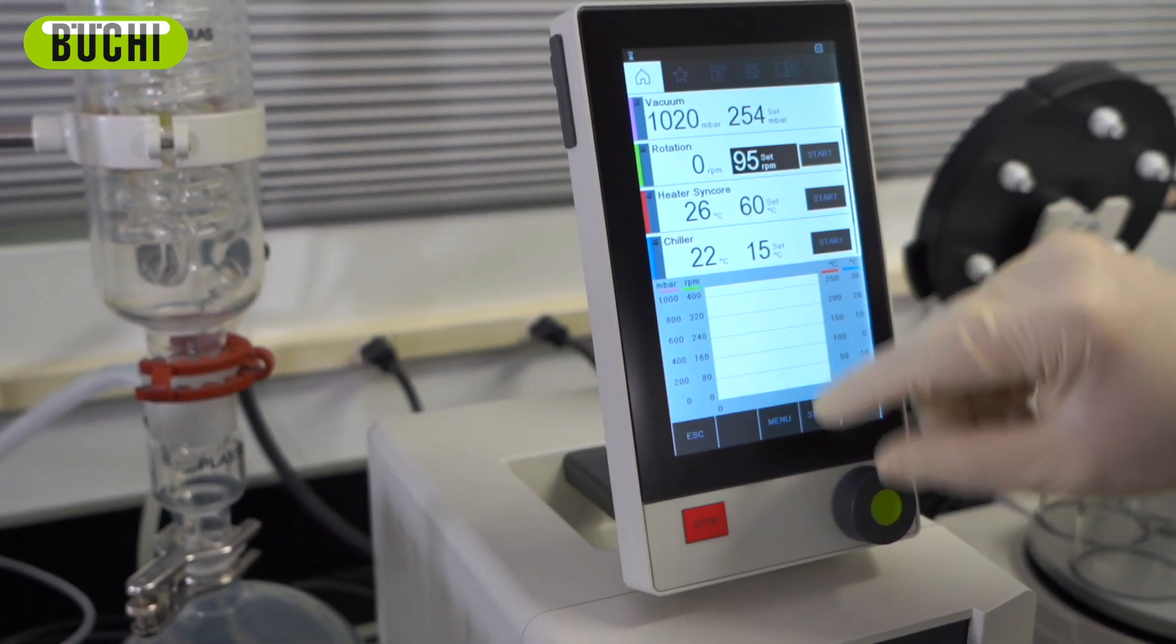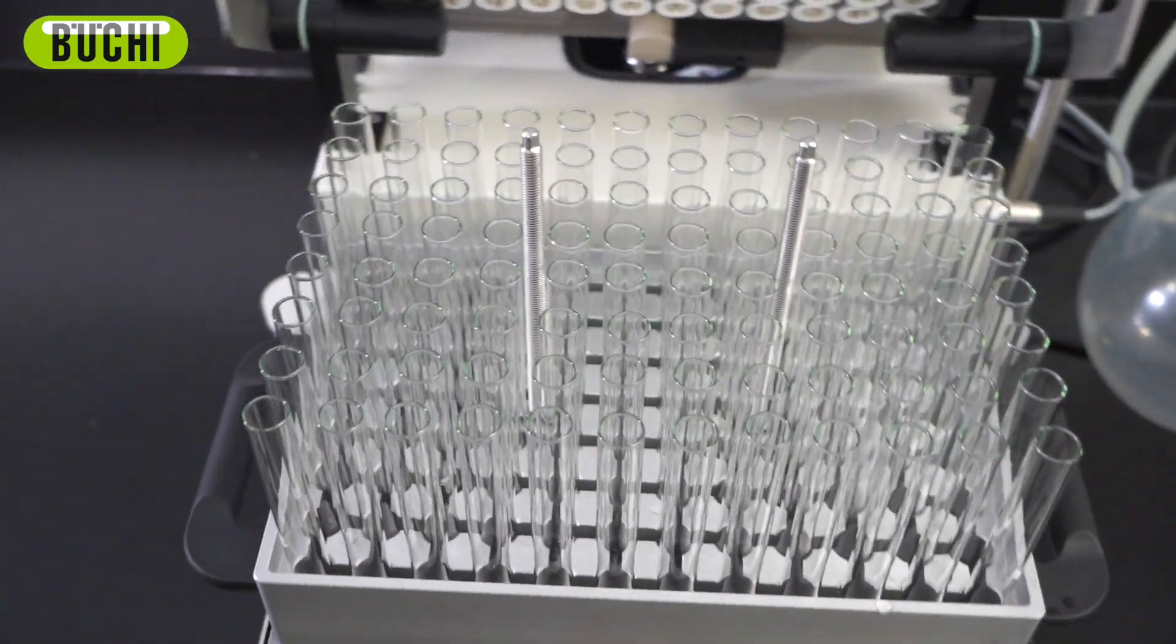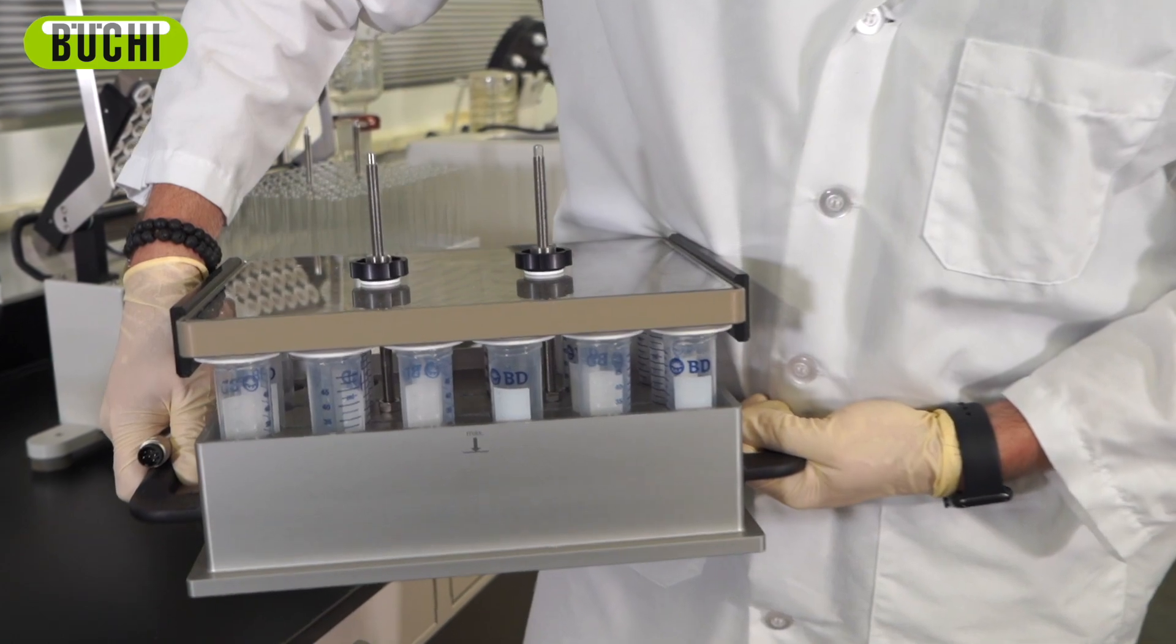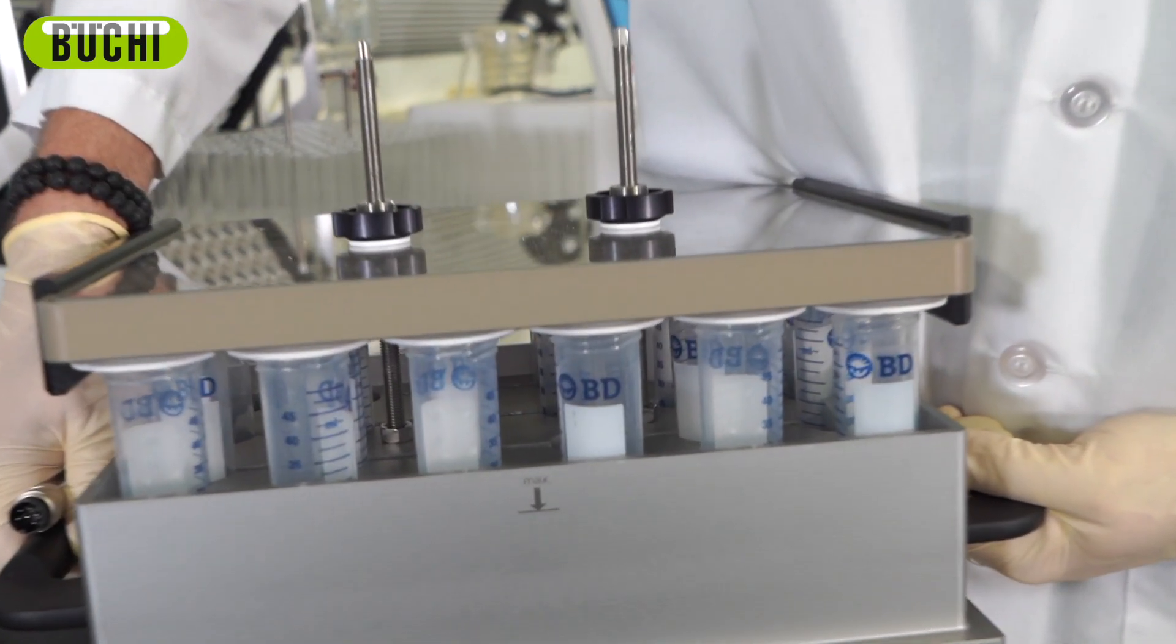The Polyvap comes in multiple position racks, from 4 samples to 96 samples at one time, emphasizing the unique versatility for high throughput labs. And, we can't forget to mention Buchi has racks that can fit your standard test tubes or falcon tubes.